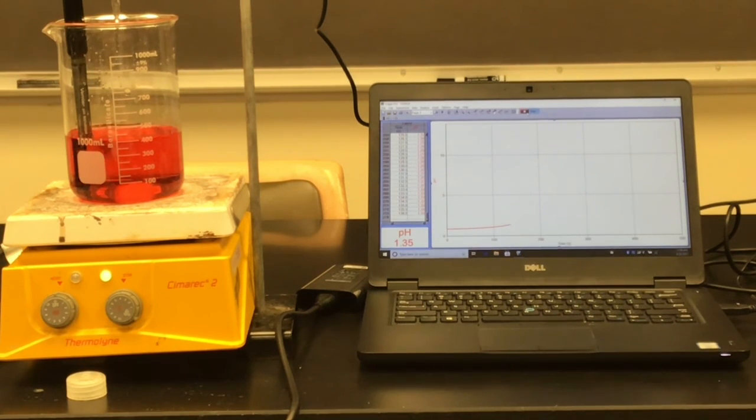And it's still red. I haven't seen orange, yellow, green, blue, nothing. It's still red. Now I'm going up a smidge. And maybe you can start to see a little action occurring over there on the beaker. But we're still red. Oh, wait a minute. Check it out. Wait a minute.